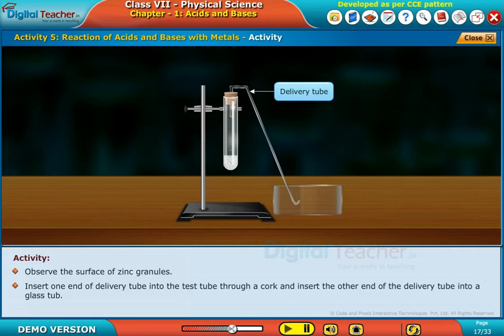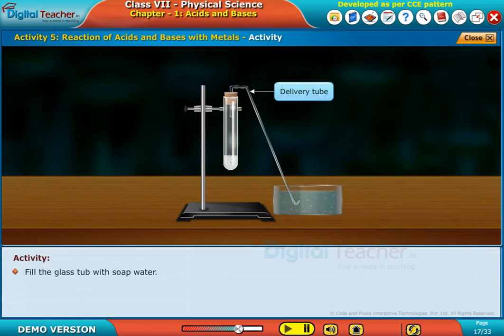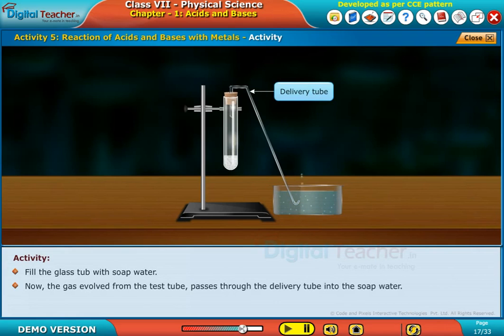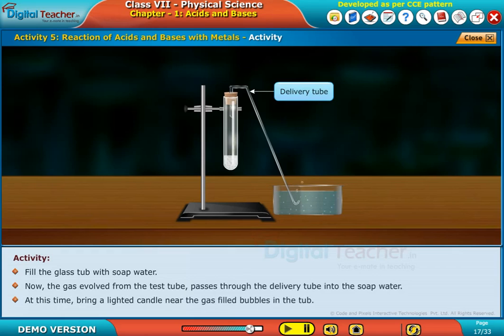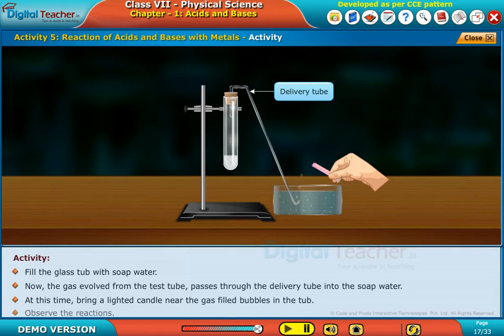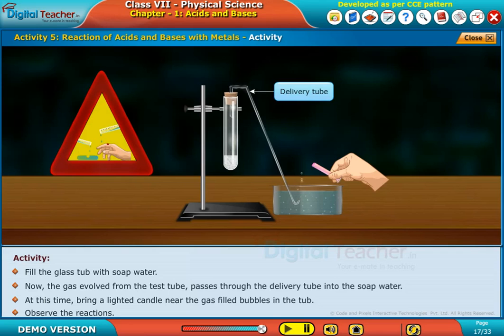Insert one end of the delivery tube into the test tube through a cork, and insert the other end of the delivery tube into a glass tub. Fill the glass tub with soap water. The gas evolved from the test tube passes through the delivery tube into the soap water.